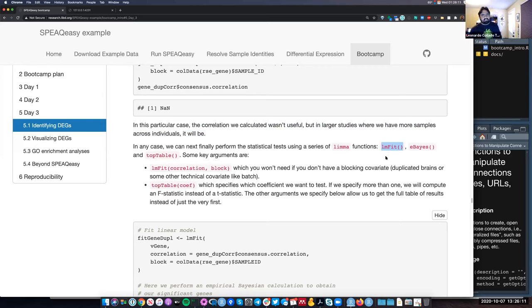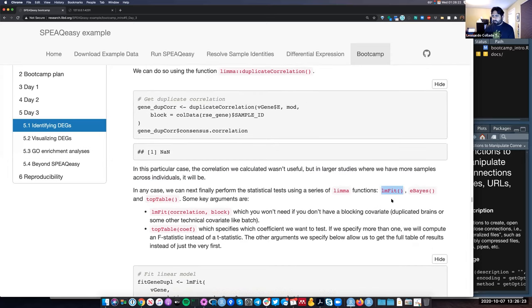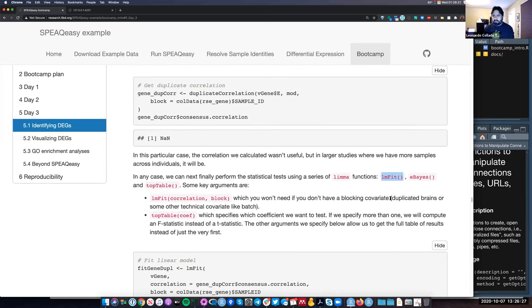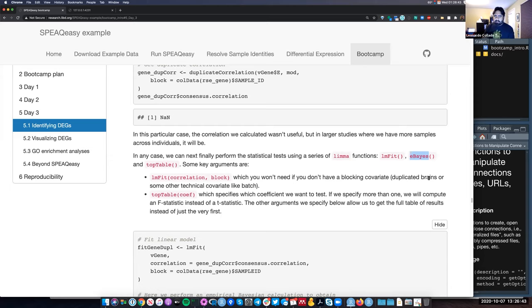The first function in this trio is lmFit, which is actually going to run all the linear regressions. Or if we're using duplicate correlation, it will run generalized linear regression, which is more computationally intensive but necessary for complicated projects. Then the next function is called eBayes, which runs an empirical Bayes step. This is where we can start to get t-statistics and p-values out of our model, and it does so in a way that with very few samples you get more precise statistics than with regular linear regression in R.